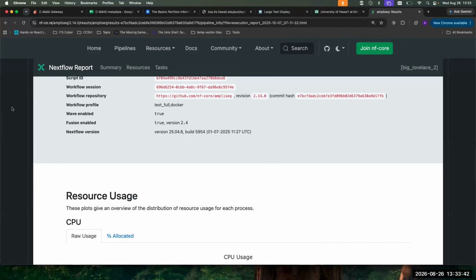So there's no bioinformatics in it. It's just, I use this pipeline. And so for Cedric's pipeline for 16S, you have to cite Andrea Yanni's paper, which basically has all the default parameters. And then I think Leah Thompson's paper has some of the parameters for the ITS, Cedric's old ITS pipeline.